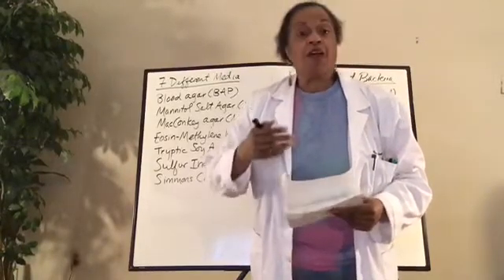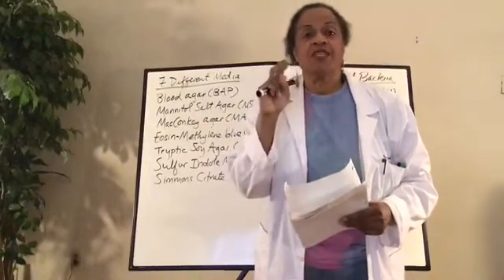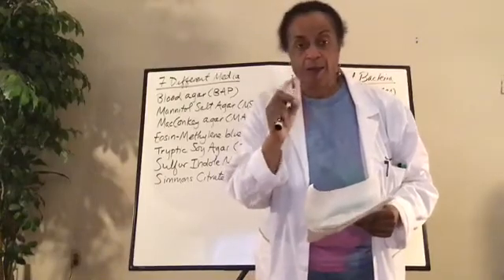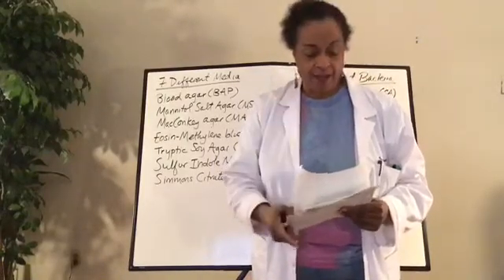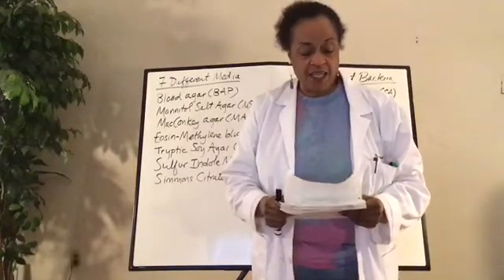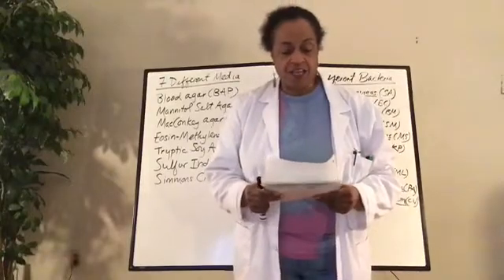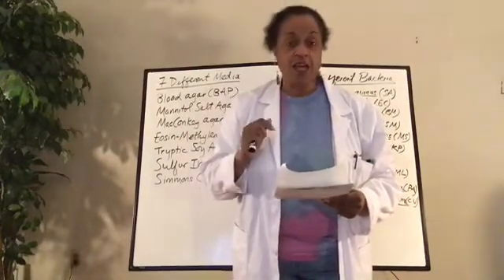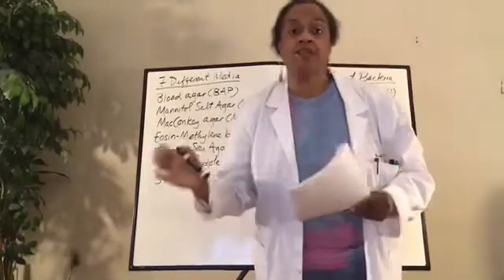Other things, like a formation of gas bubbles or even precipitation, little things crystallizing out of it. Those are properties and observations I need you to point out in your writing. Differential media contains substances that cause some bacteria to take on an appearance that distinguishes them from another bacteria. That's why it's differential. You can tell the difference.